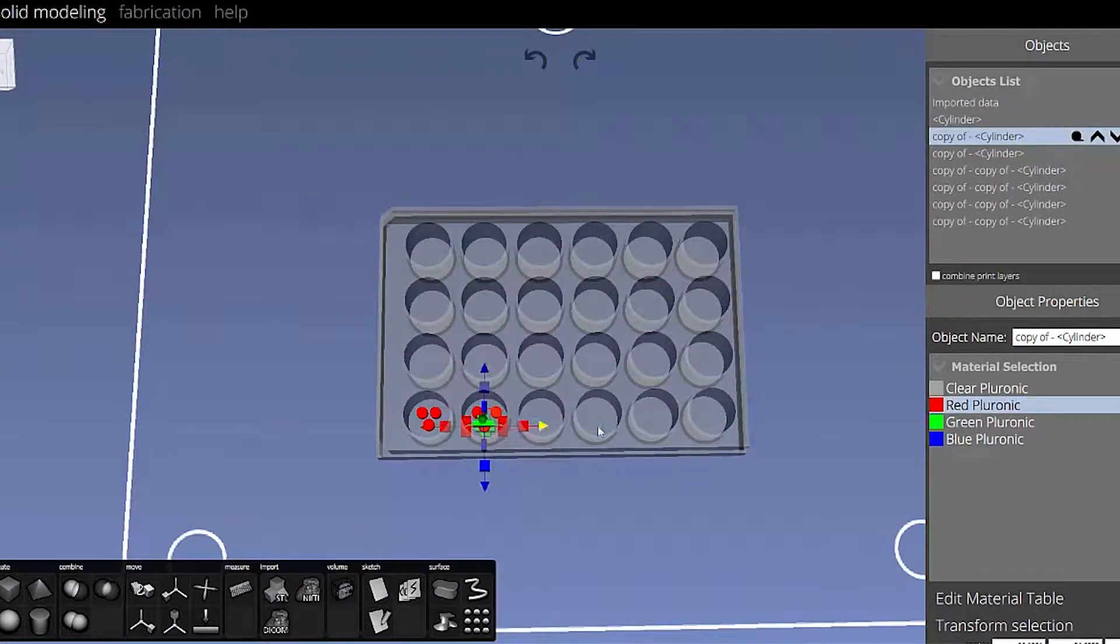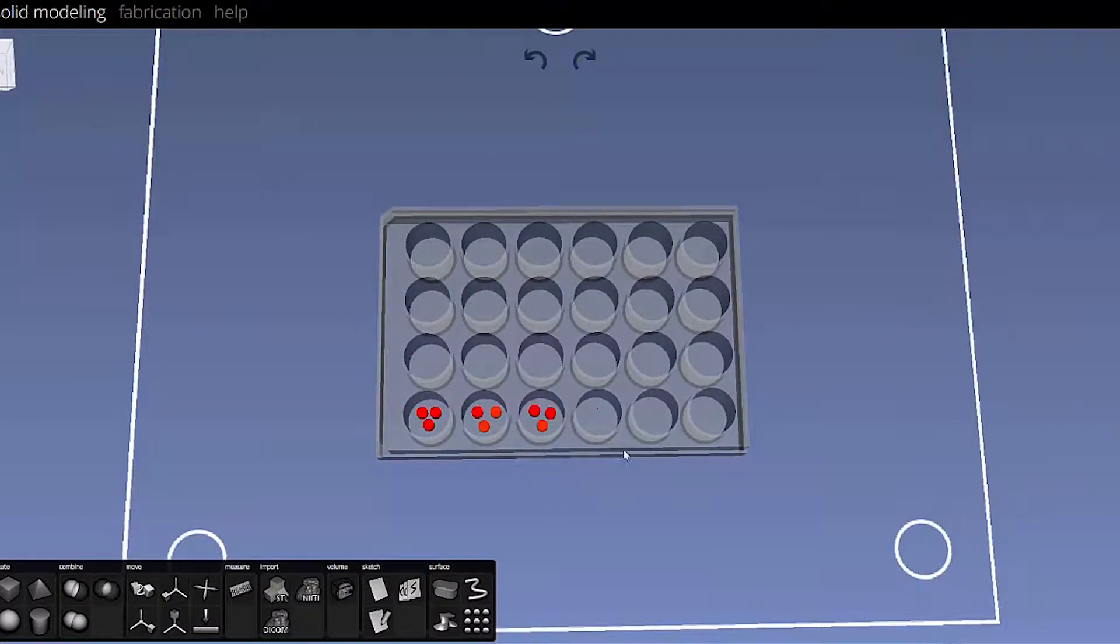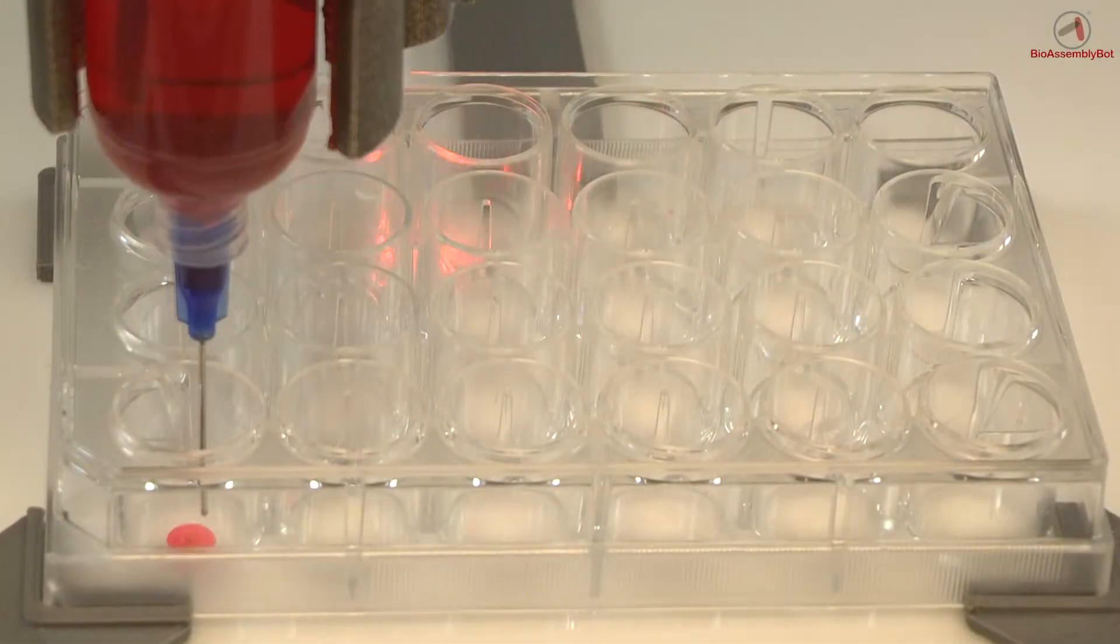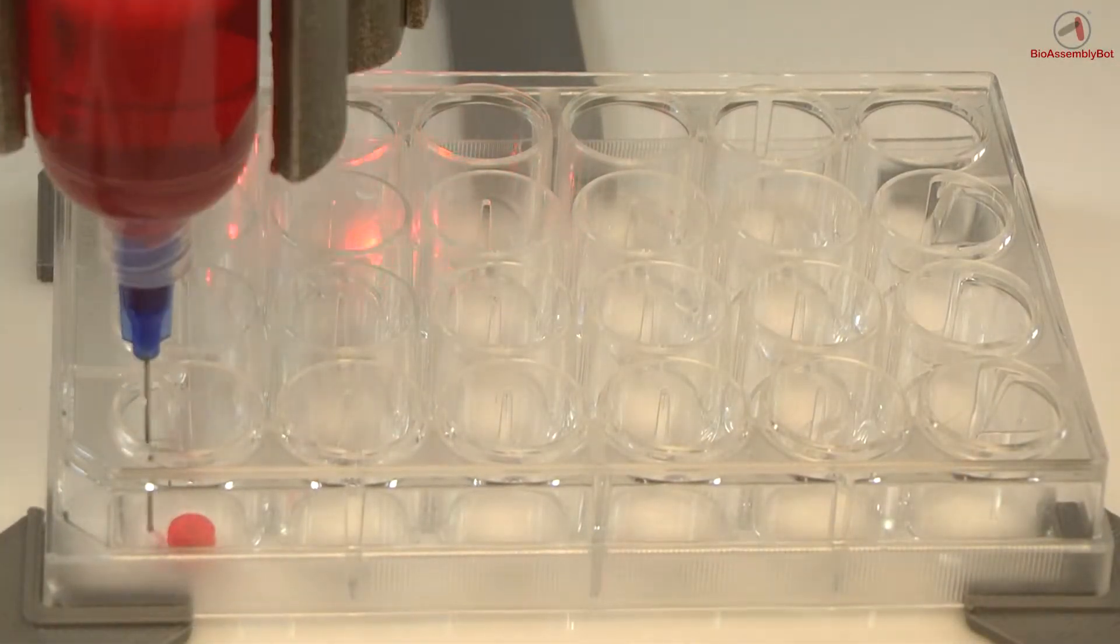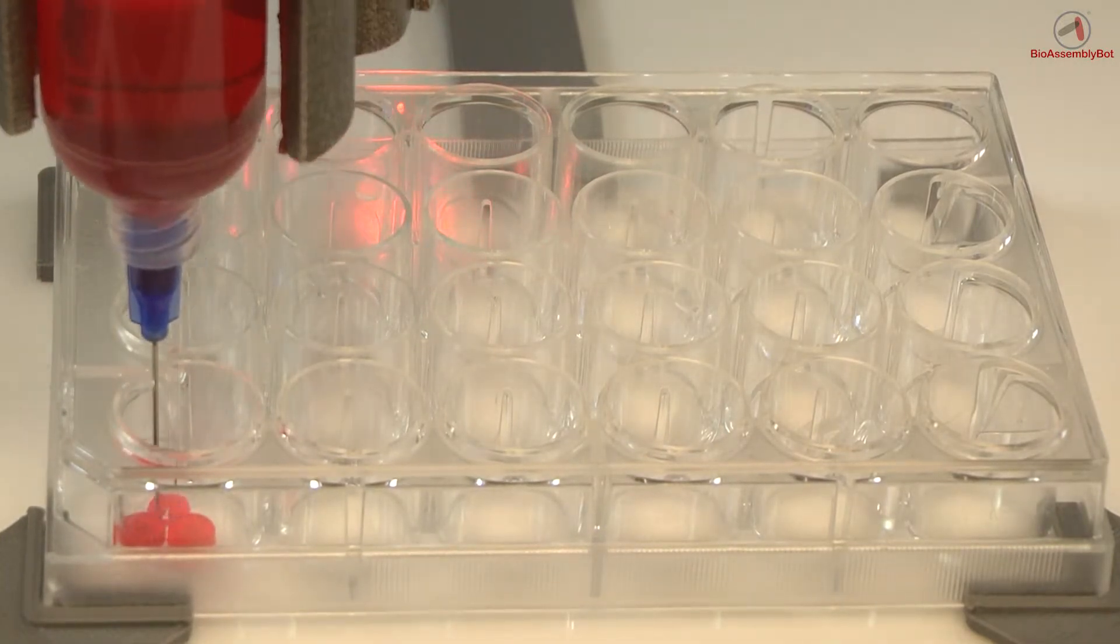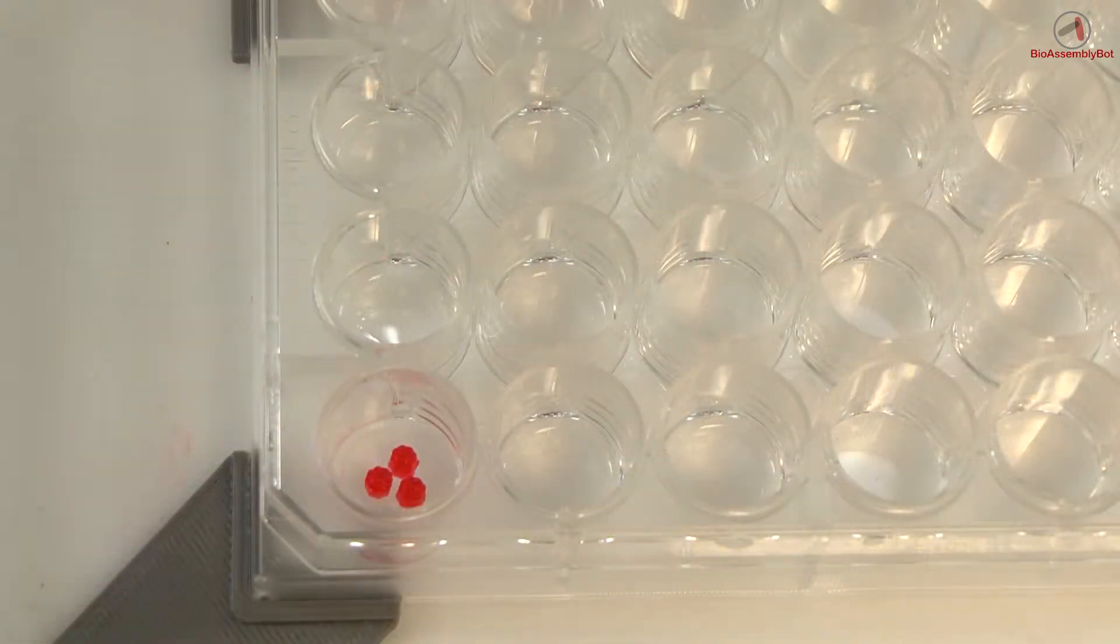This particular example demonstrates printing different tissue models within an assay plate, in this case a 12-well plate. The first example is printing three different tissue constructs or compartments - this could be epithelial cells, cardiomyocytes, whatever the case may be.